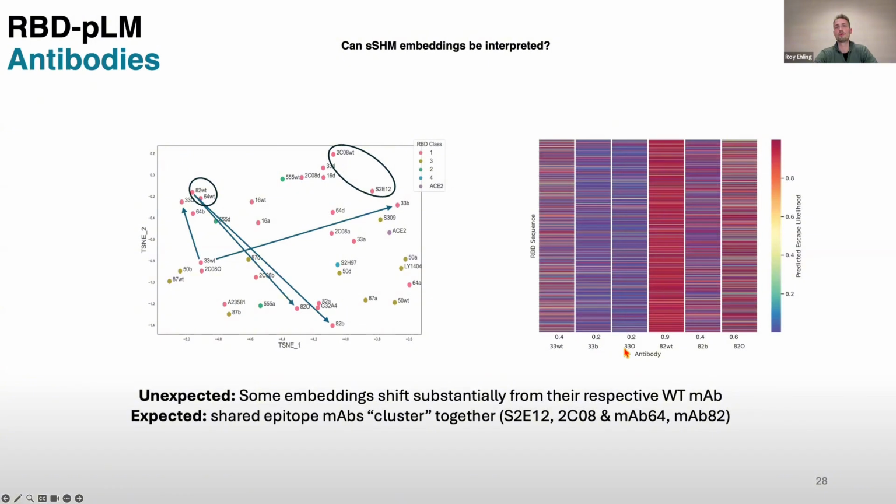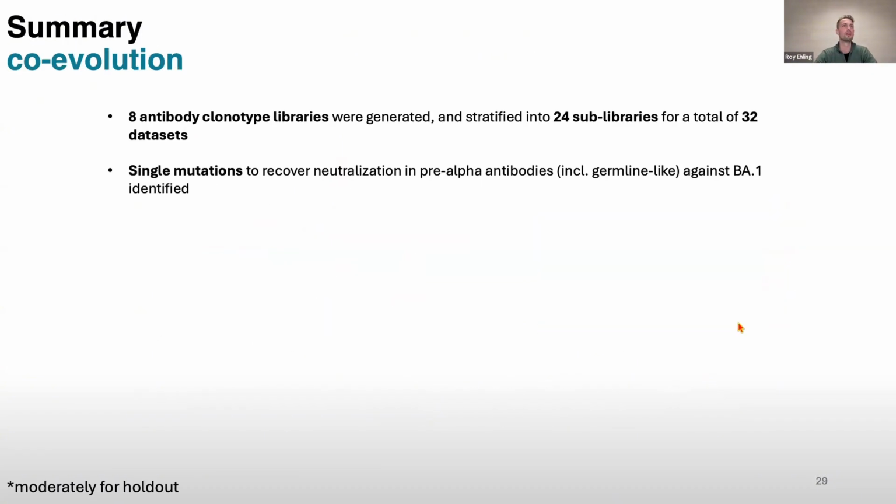We also observe the trends that we see by FACS. For example, when you select our Regeneron 33 antibody for beta or Omicron binding, then its breadth is improved, while conversely, as I touched on in the neutralization, when you mutagenize MAB82 and select it for beta and Omicron, it becomes a much more nuanced or limited breadth. We were glad to see that the model produces similar results as observed by FACS, which validated that the model is not learning noise. With ML, you always have to be careful that you're not training on BS and then something weird comes out.